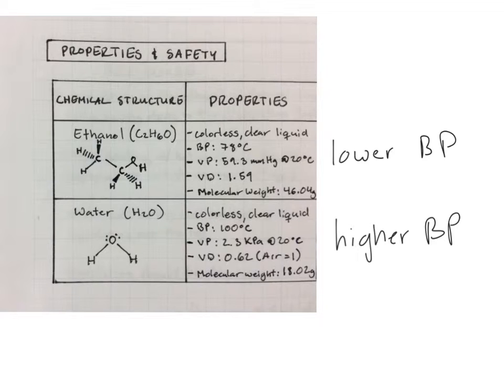And by using these different temperatures at which they evaporate is how we are going to separate ethanol from water. We expect ethanol to evaporate earlier than water because of this temperature. So whenever the temperature reaches around 78 degrees, we expect the vapor and the distillate going into the graduated cylinder to be ethanol.